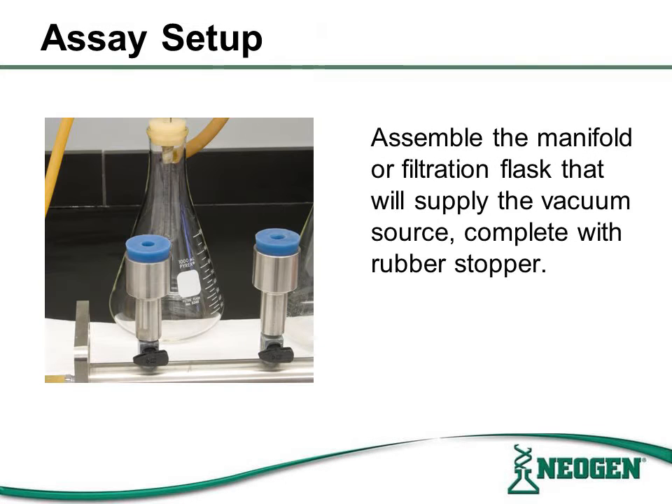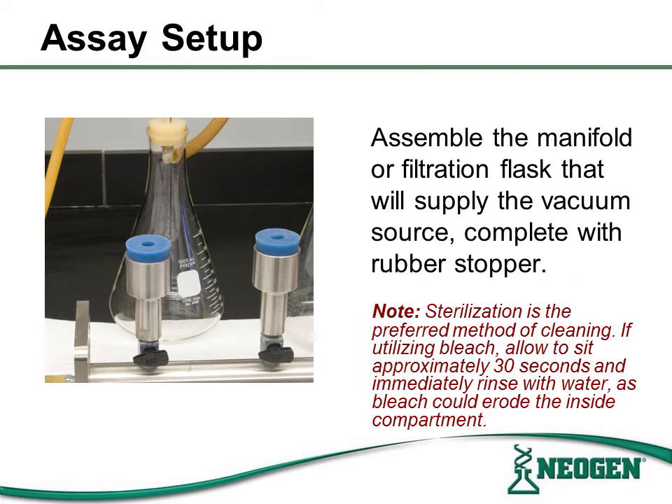The assay assembly is just as important as the filtration procedure. Ensure the manifold is connected properly to the vacuum source with a rubber stopper that creates a secure seal. Please note that sterilization is the preferred method to clean the assembly. If an autoclave is not available, bleach is an alternative. If utilizing bleach, allow it to sit approximately 30 seconds and immediately rinse with water, as bleach can erode the inside compartments.